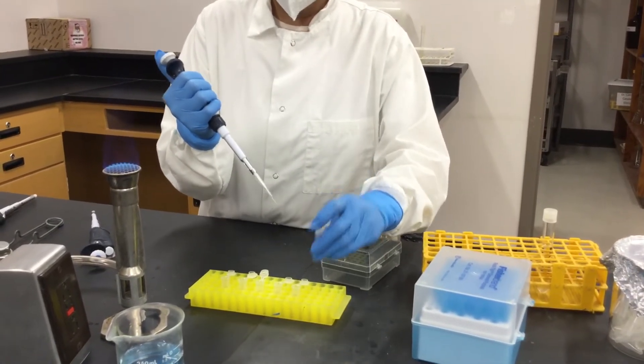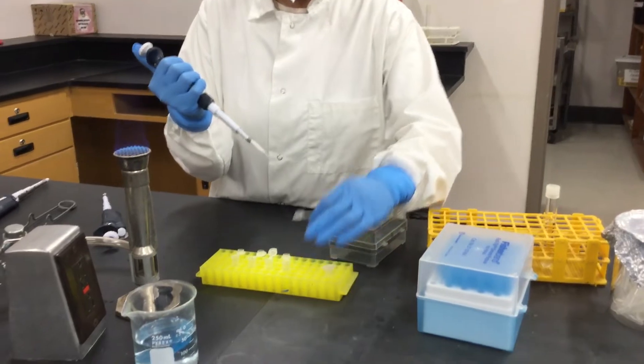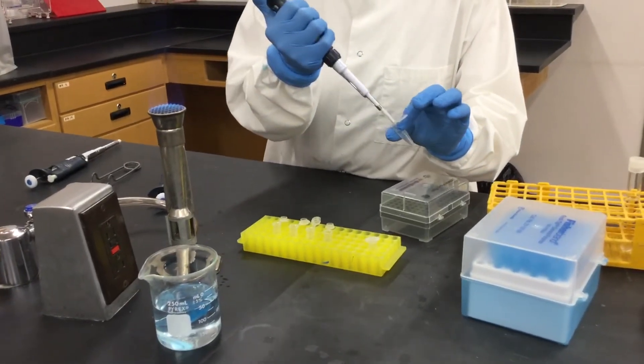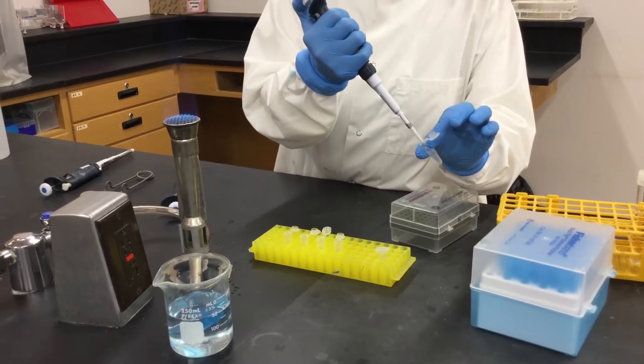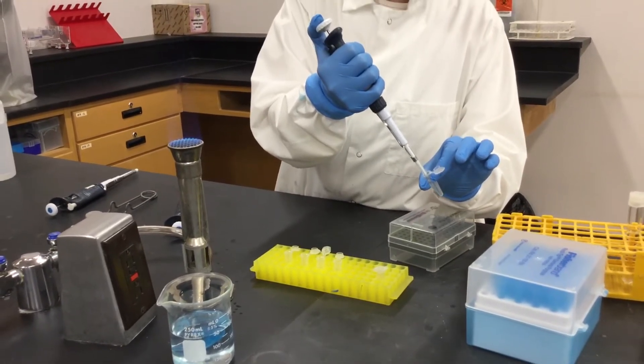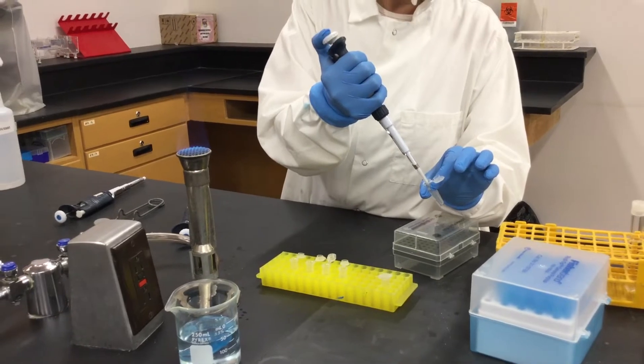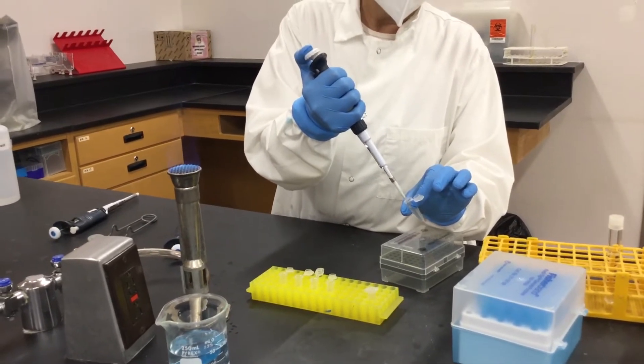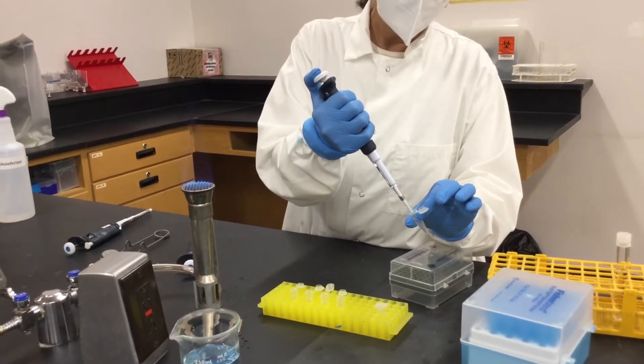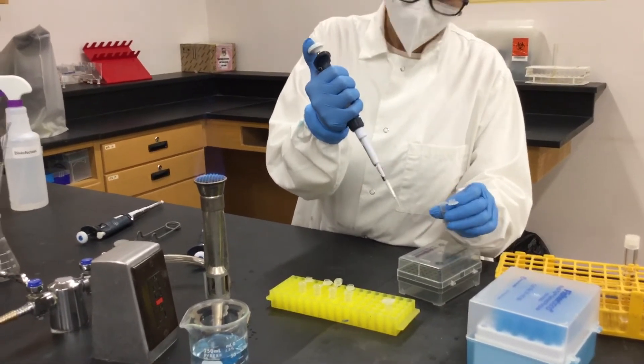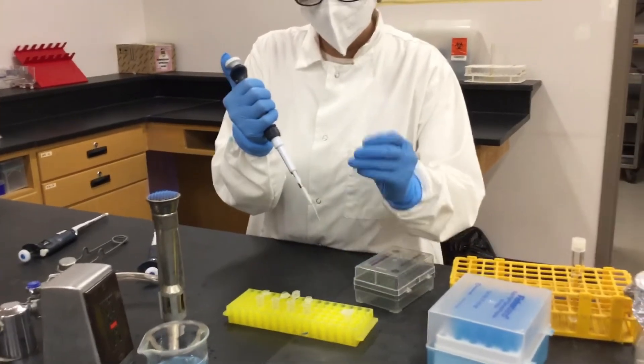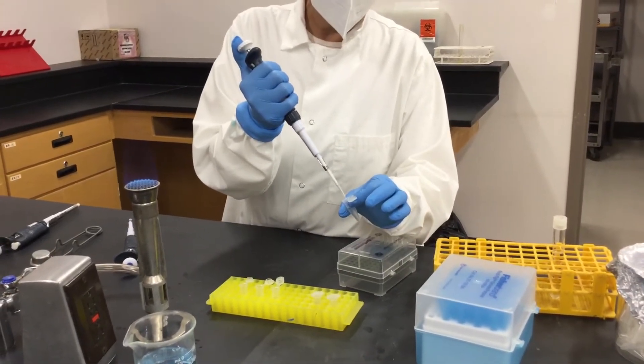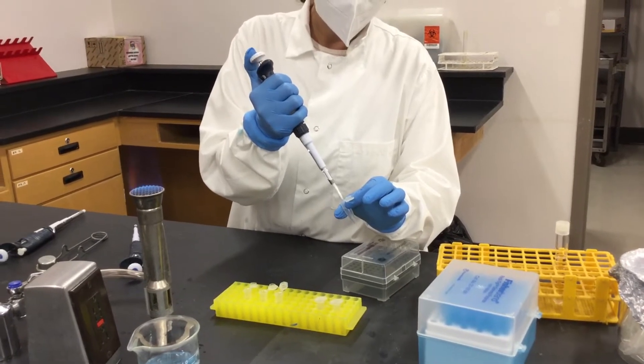Open your tube close to the sterile area. Grab the 10 microliters, add it into here by pressing the plunger and then releasing it up and down several times until you have a homogeneous mixture. And then grab 10 microliters, close this. This was the 10 to the minus 2, and add it to the next tube which is going to be the 10 to the minus 4.